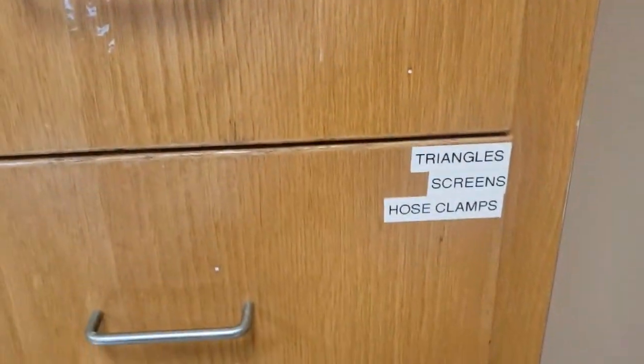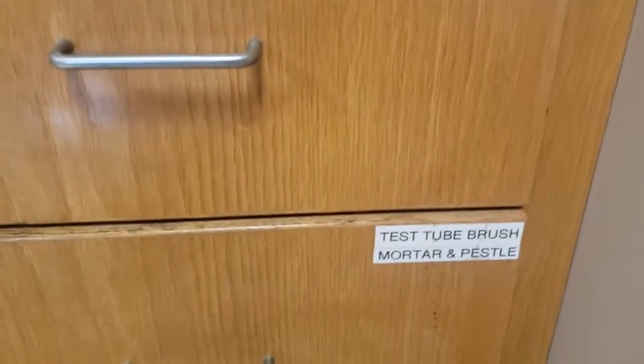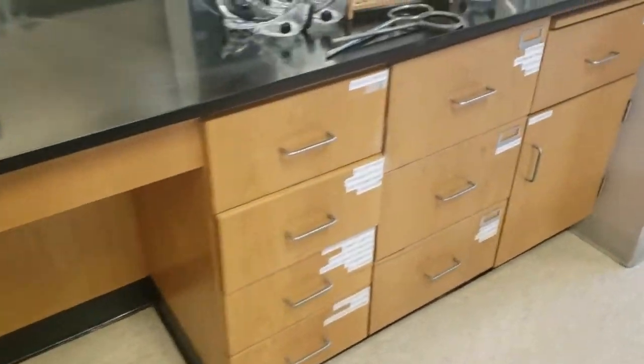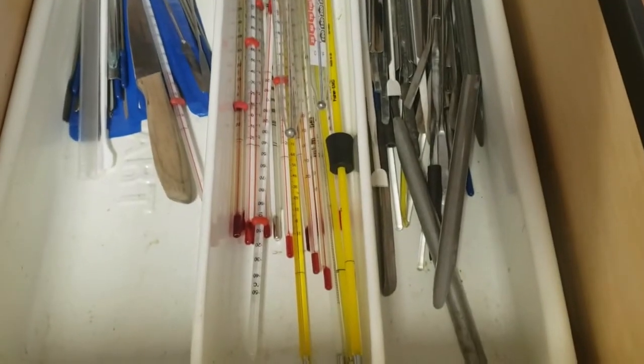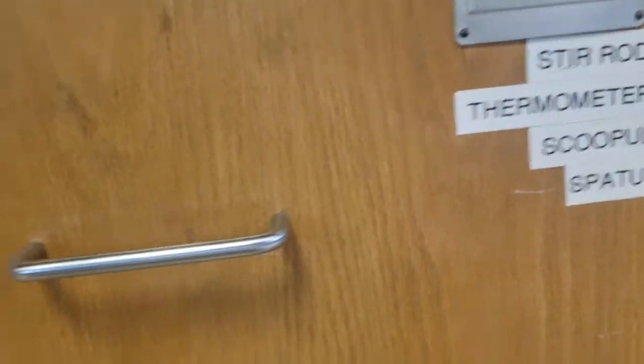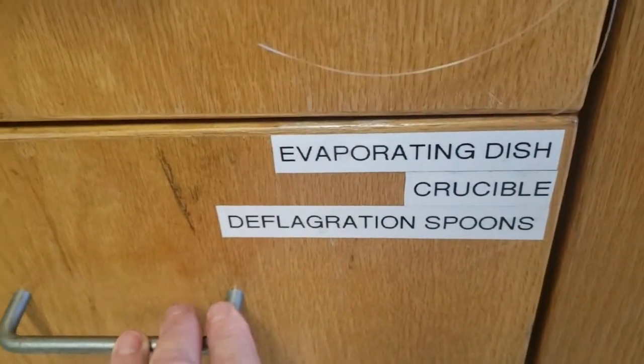There's the tongs on the wall near the door. There are the triangles if you need a brush or a mortar and pestle. On this middle section, it's got the scoopulas, spatulas, thermometers. You go a little farther down to the left, you'll find evaporating dishes.